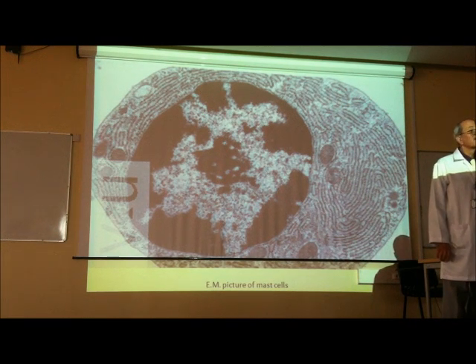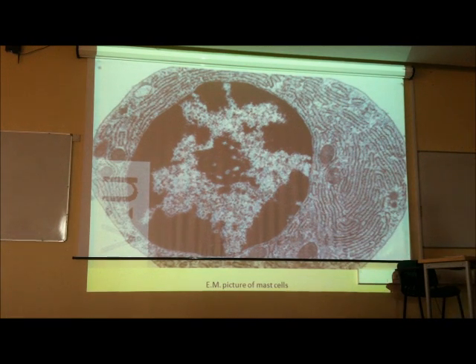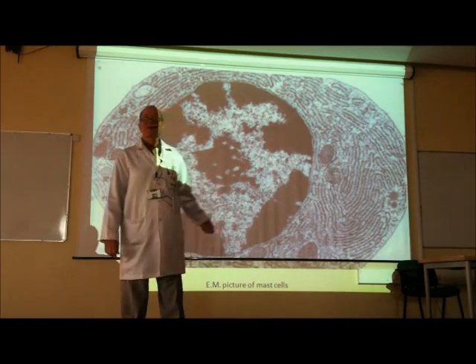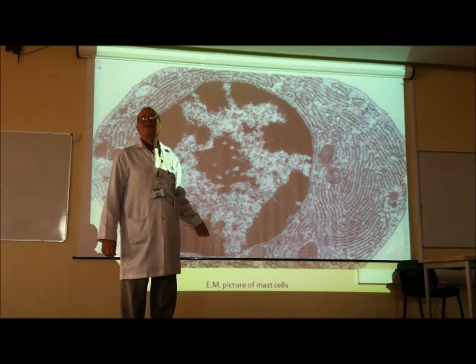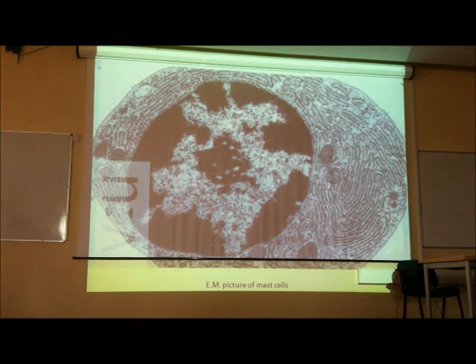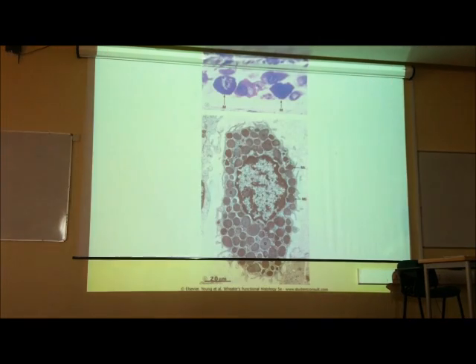Okay? No, it's wrong. I will let you see the mast cell. You will see the mast cell, okay?